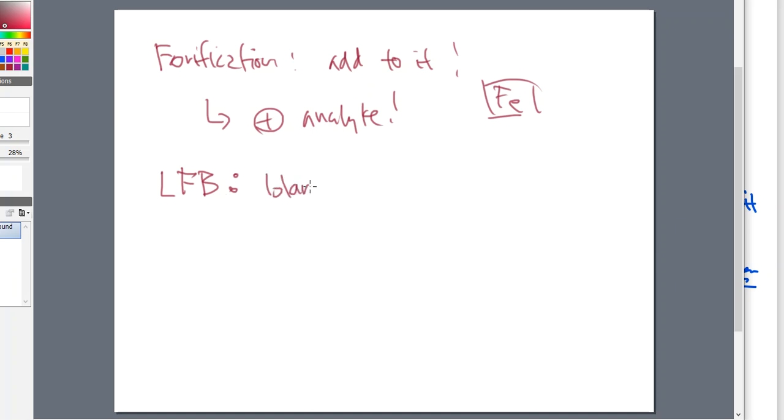So a blank, we've already talked about this. A blank could just simply be the solvent. Maybe that is just DI water, right? Maybe that's all that it is. Whatever the case is, use it. Acid, base. I mean, we talked about the options.